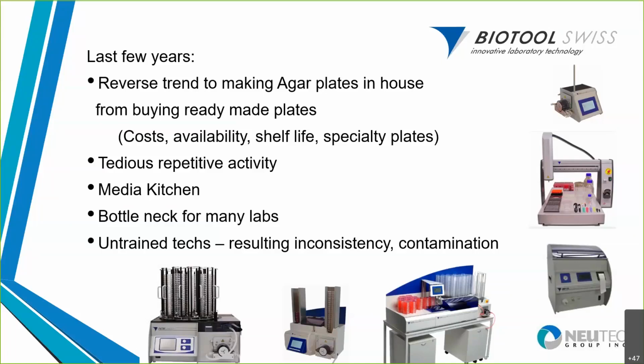where you start to see potential interruptions in supply chains, and maybe you can't get those media when you need them. Shelf life is, of course, a consideration. These have a limited shelf life, so you can't stock huge numbers of them in inventory and then just use them when you need them. When you acquire them, they need to be used fairly quickly. And then it makes it difficult to do any kind of specialty plates where you might want to do selective media to look for special organisms, or different types of media that you might want to use.